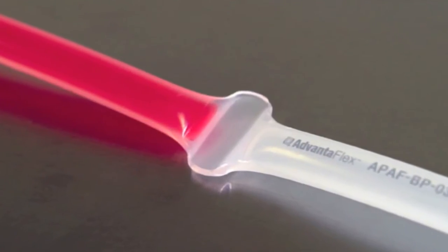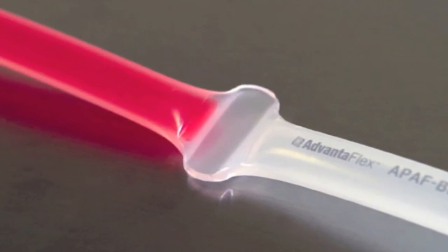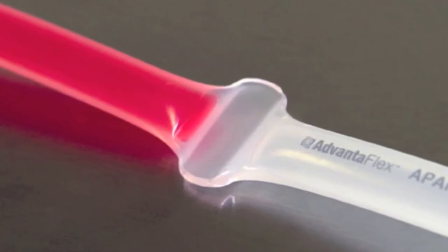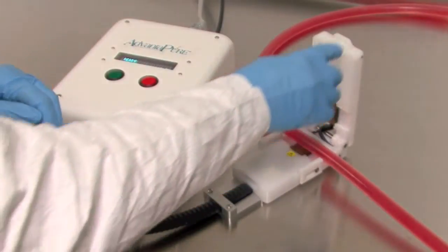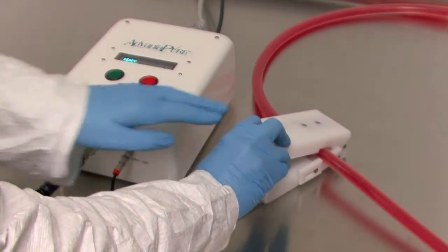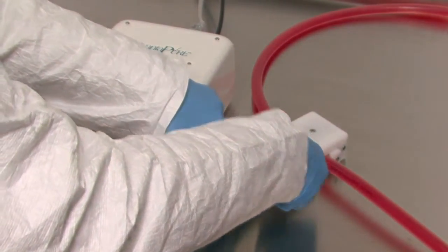Advantiflex's ability to be heat-sealed gives it an advantage over other elastomers like silicone. Sealing separates the tubing into isolated sections for applications such as sampling. Special sealing equipment allows a technician to contain fluid samples within a single length of tubing.